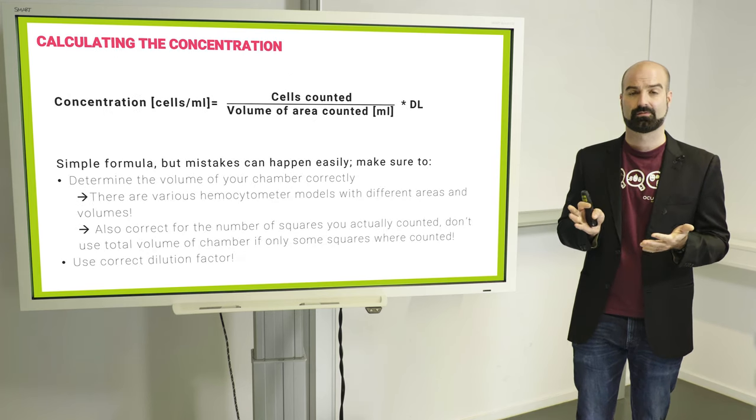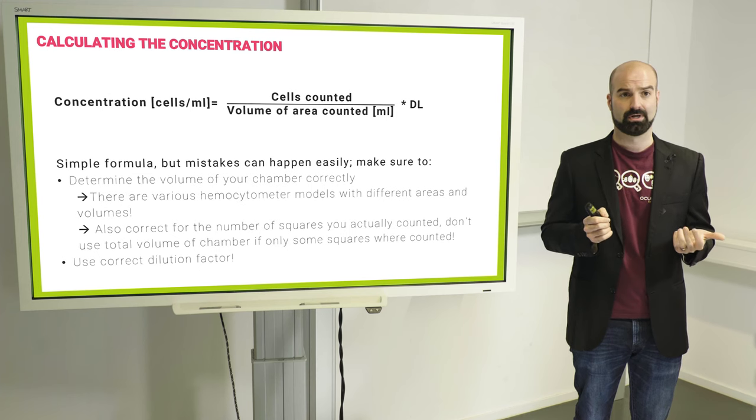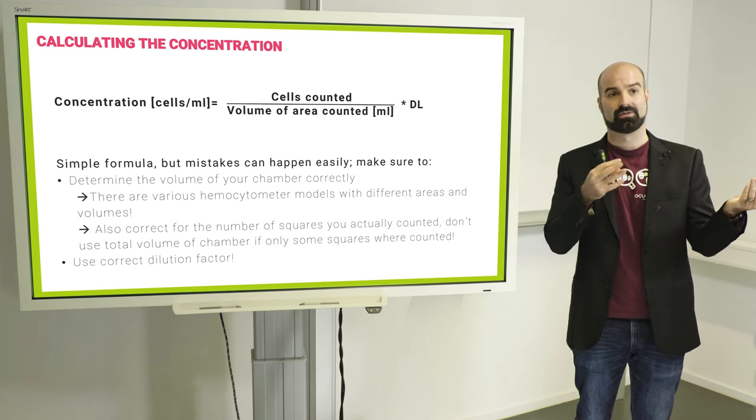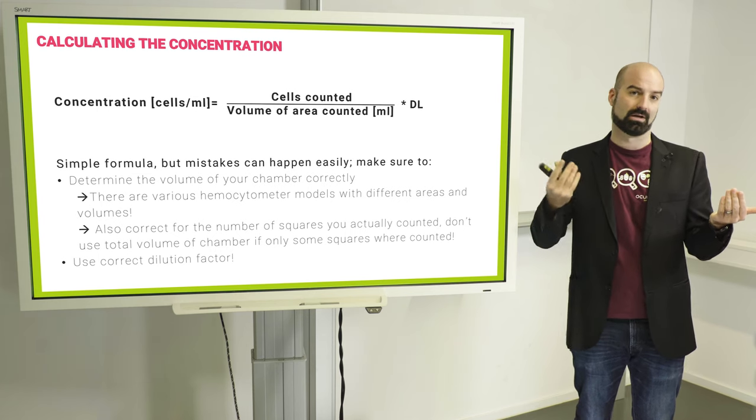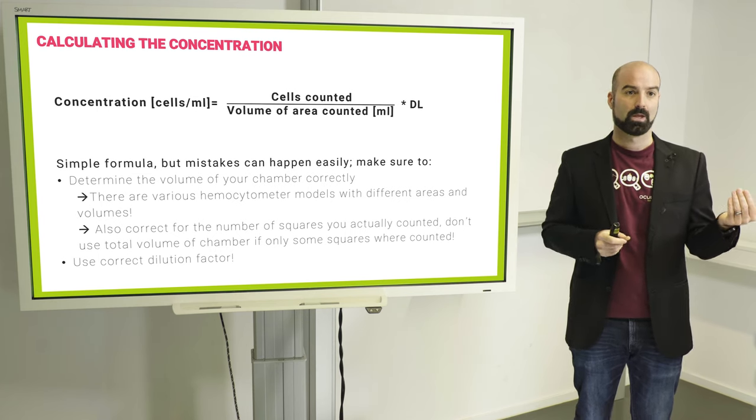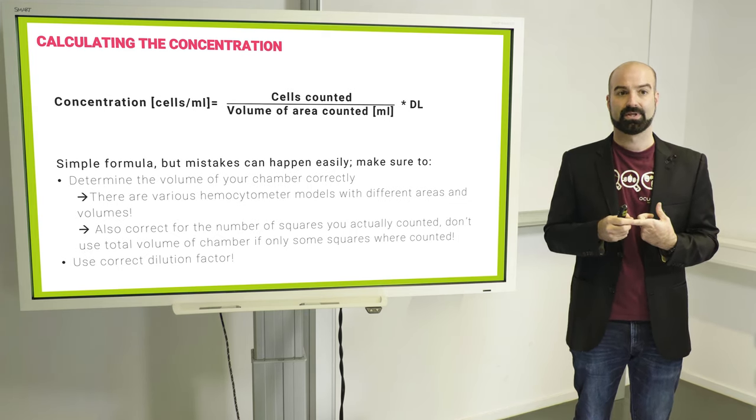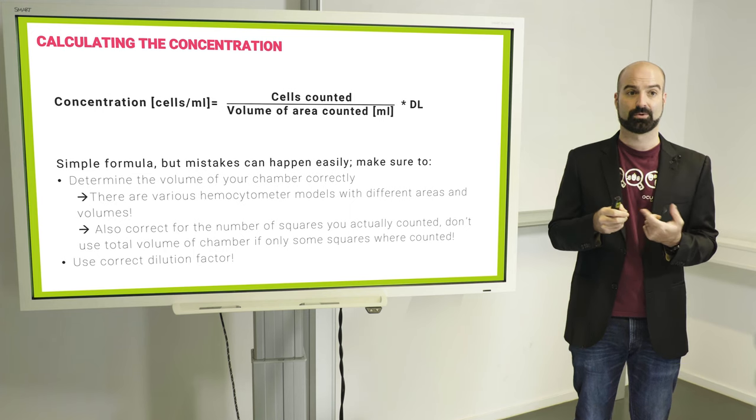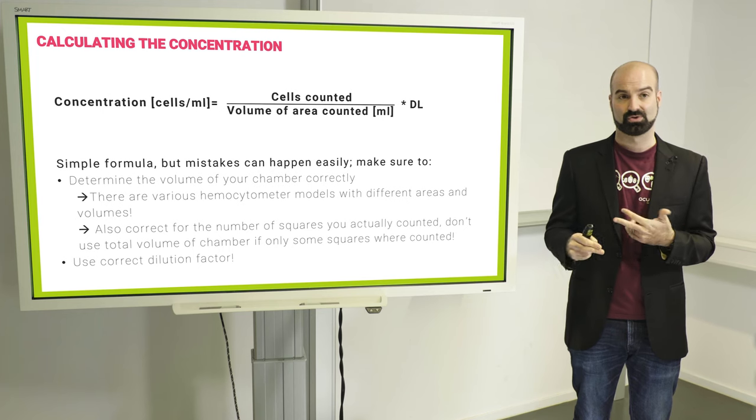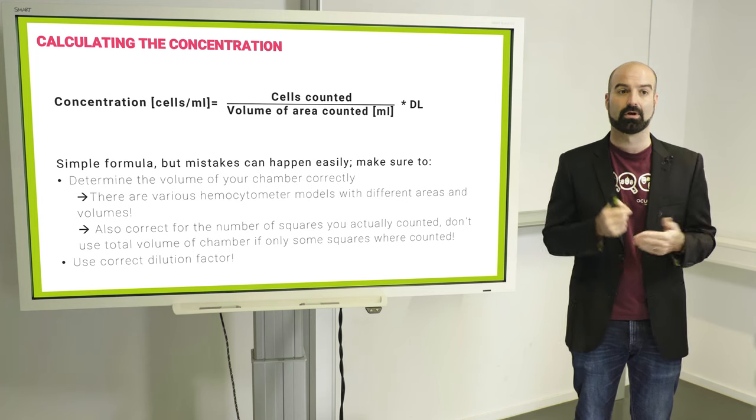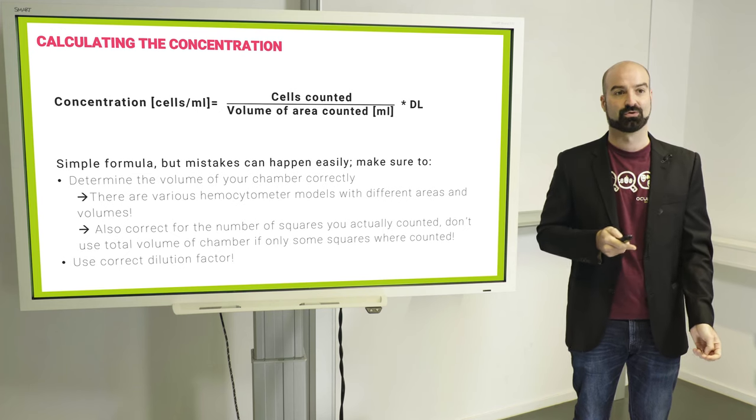And then calculation mistakes. If you take the very basic formula for how to calculate your concentration in a hemocytometer, it's fairly simple. You have the cells you counted divided by the volume that you counted them in and then you add a dilution factor if you diluted. So not complex here, but errors can happen, especially since there are hemocytometers with different areas and you also have to correct for how many squares you counted because almost no one will count the entire area of a hemocytometer. And as I mentioned before, actually use the correct dilution factor.